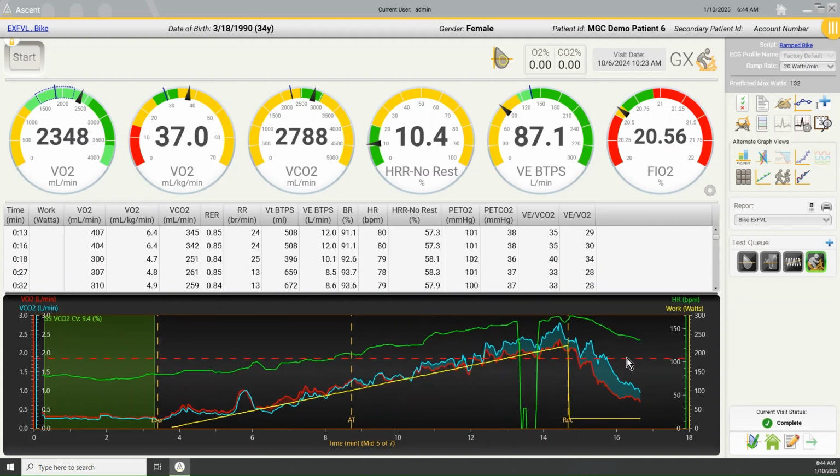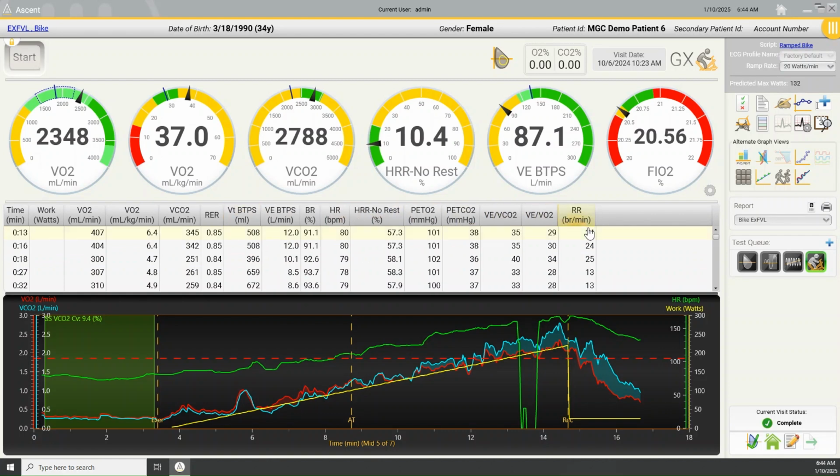With this testing screen here, I want to highlight a couple of different things. In the actual testing screen, you can drag and drop to rearrange the variables for that specific test only as you see fit. But that is a nice feature. We will touch on F5 options to organize those a bit later.